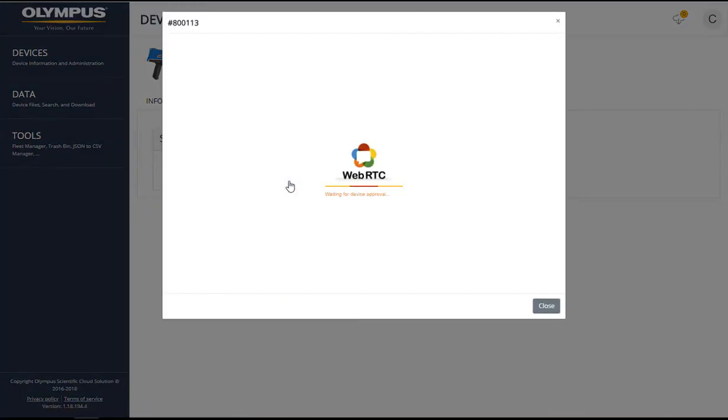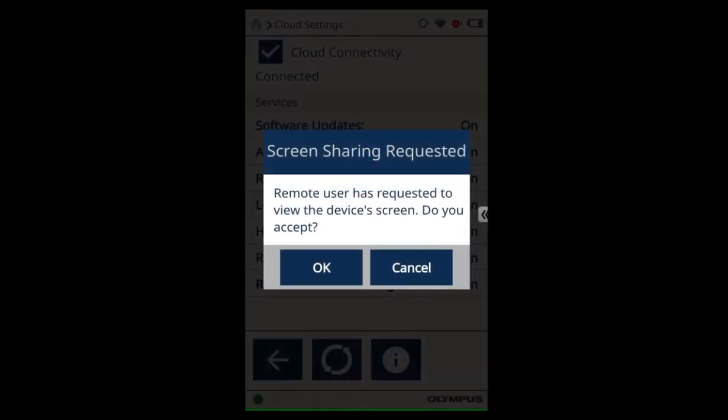The window will display the message waiting for device approval. On your Vanta, select OK to allow a remote user to view your screen.